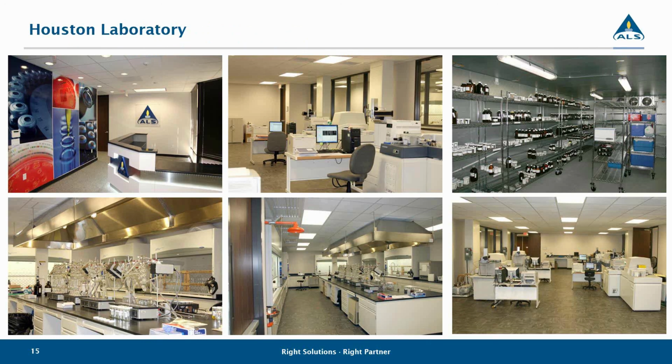Nicole, can you just expand on that and talk a little bit about the standard turnaround times? Because he asked about rush, but I'm sure some people are curious about standard turnaround times. Yes, our standard turnaround time is 15 business days for dioxins and furans and 20 business days for PCB congeners. Of course, we can make exceptions when we have regular projects. Sometimes projects require a little bit smaller turnaround times of 10 to 15 business days, and we'll work with you on your turnaround times and try to meet your project needs and price it appropriately. Great, thanks, Nicole. You're welcome.